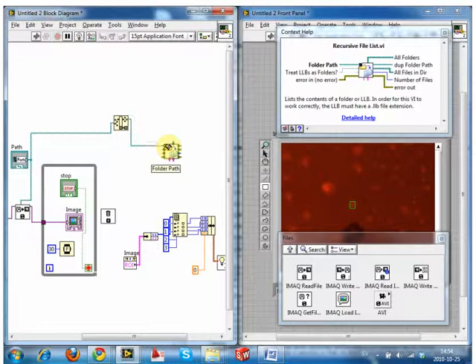These two things down here, like the pattern and the folders to exclude, actually allow you to be very selective about what files it reads. We can put in a particular pattern for the file name, like for the confocal images, for example, it can have in the file extension somewhere telling you which channel it's reading from, like say CH01 or CH00.